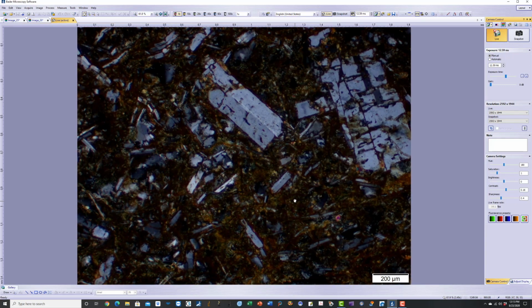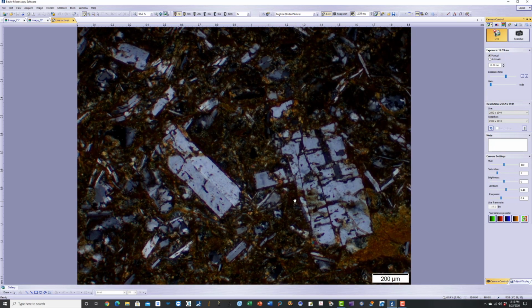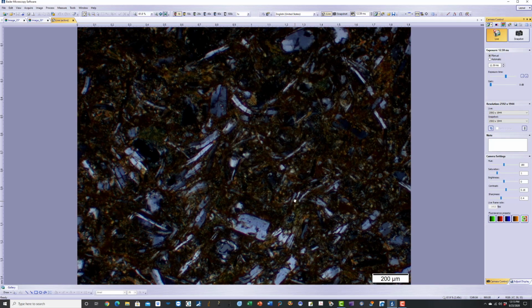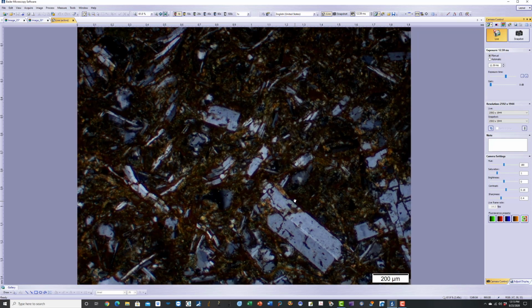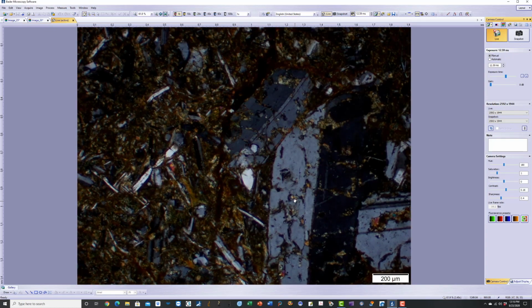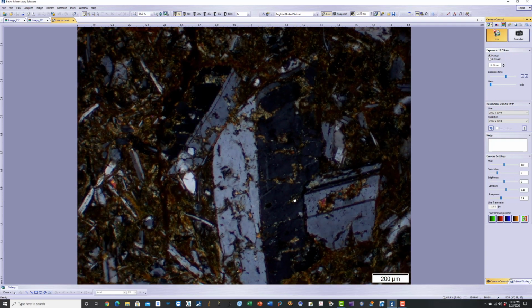These are all showing the porphyritic texture, typical porphyritic texture of volcanic rocks, with euhedral to subhedral phenocryst of plagioclase feldspar, albite, oligoclase, and andesine-based plagioclase feldspar with lamellar twinning. You have some phenocryst of large coarse grain crystals of feldspar, as well as fine grained laths, crystallites and microlites of feldspar in a dark ferruginous glass matrix. This is a volcanic rock called andesite, where you see this phenocryst of feldspar with lamellar twinning.